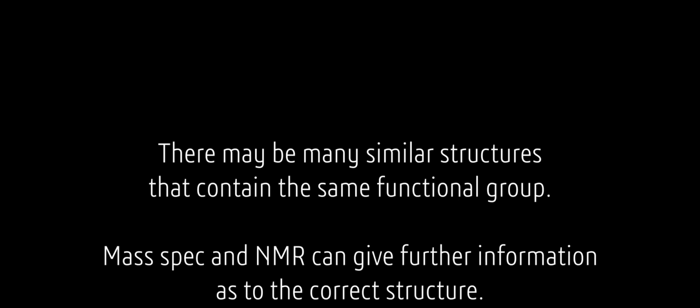For an IR spectrum, there may be similar structures that contain the same functional group. Mass spectroscopy, proton NMR and carbon-13 NMR can give further information as to the actual correct structure.